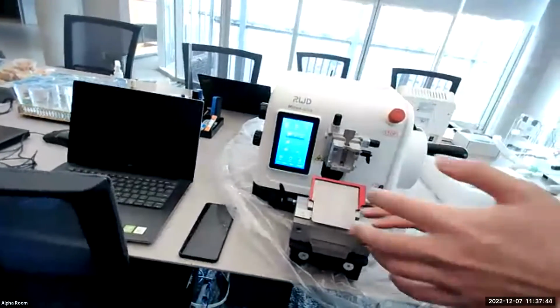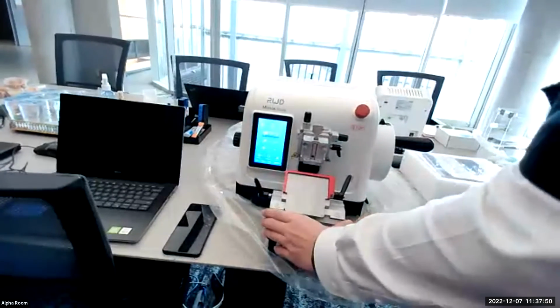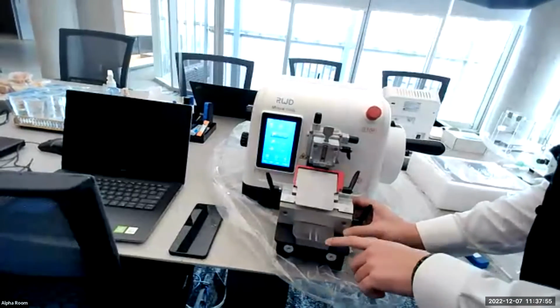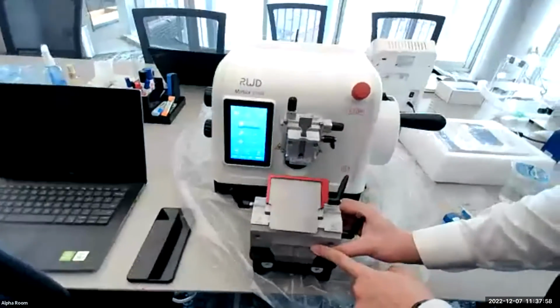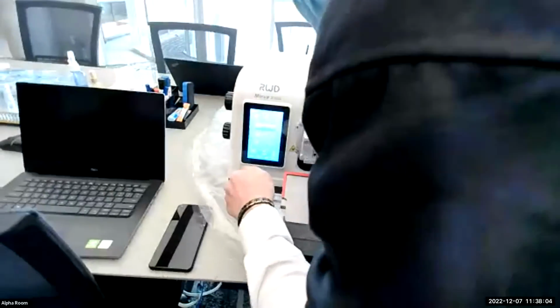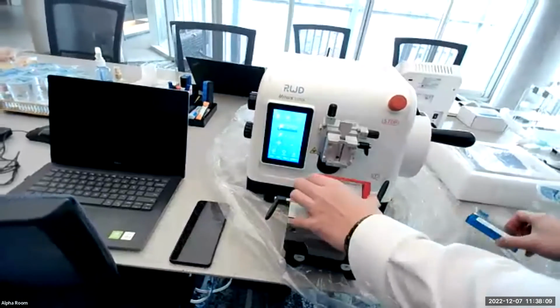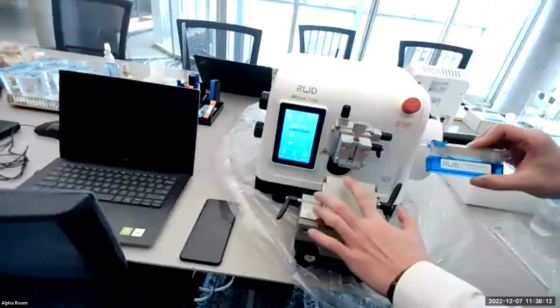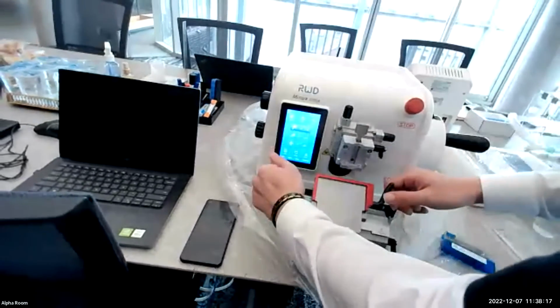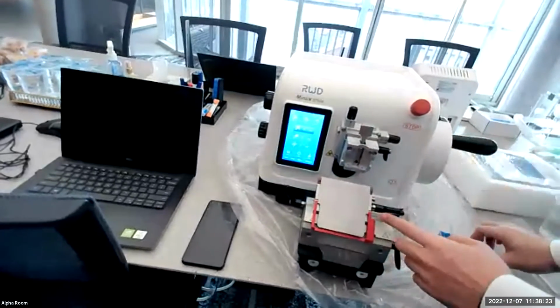And this part is our blade holder, and we can move the blade holder. And for this, we can move this, so we can use the blade for any part. For this, we can put the blade in it, so open this.